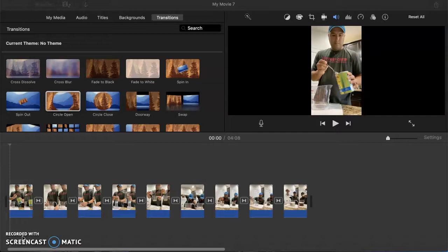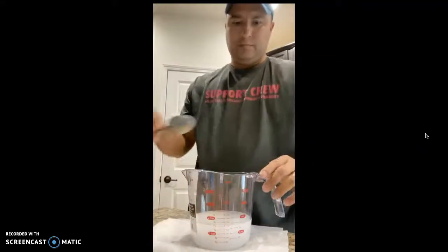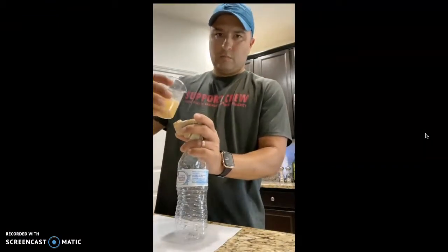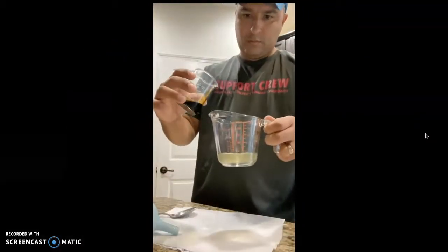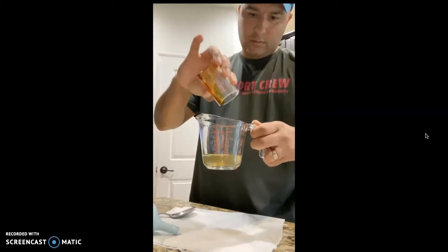So today we're going to be doing the iodine clock reaction, and this is what happened in the video. Basically, just like the instructions said, after watching the video, I prepared the two solutions that I was going to be using for the experiment. We have one solution of iodine and vitamin C and some water, and then the other solution is the hydrogen peroxide and the starch.